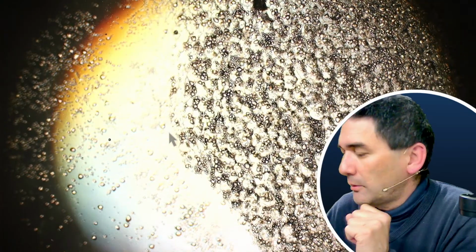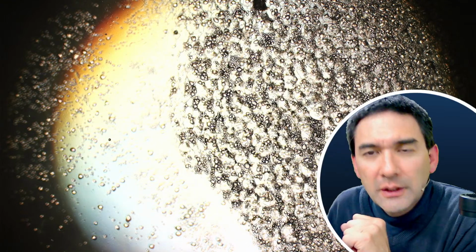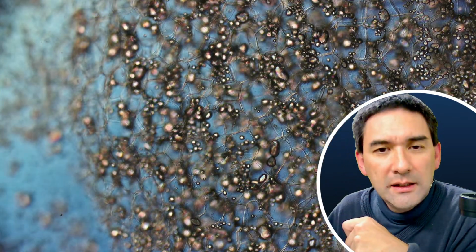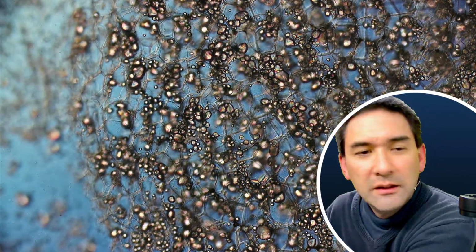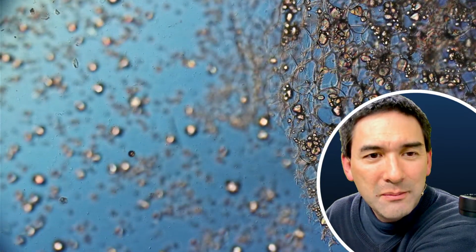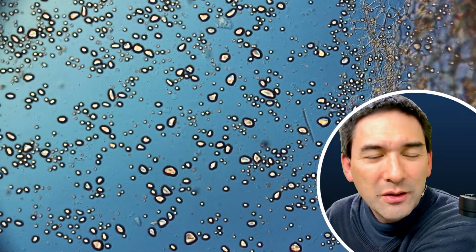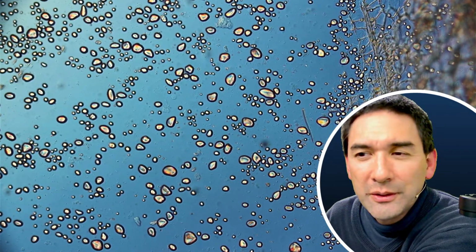Ooh, yes, actually I'm quite happy. But let's turn the arrow off because I don't like the arrow. Yep, and we actually see starch grains inside the cells. Or at least most of them should be inside the cells. Look, quite nice. Here on the side, where the specimen becomes thinner, actually where the specimen stops, you can see that these starch grains are not surrounded by a cell wall because they have been washed out.